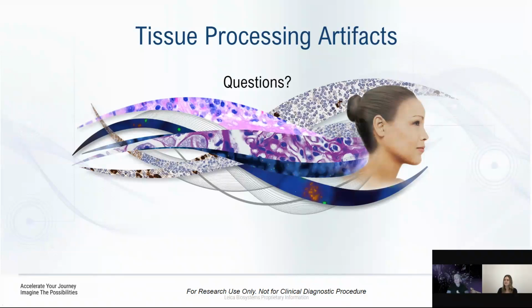So depending on how long you have used it for, you want to look at the recommendations in the literature that comes with whoever you're purchasing the hematoxylin from. Also depends on the type of hematoxylin. There are different flavors of hematoxylin. There's Harris, there's Weigert's, there's Mayer's. And so maybe that's a part of it. Maybe someone has replaced that bucket with a different type of hematoxylin, and it just doesn't look the same.